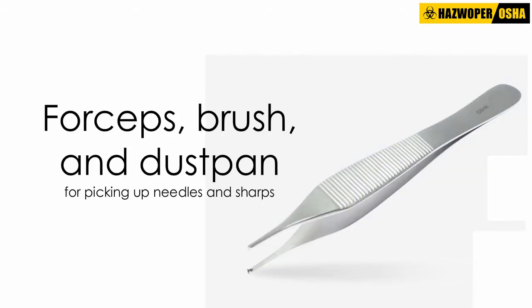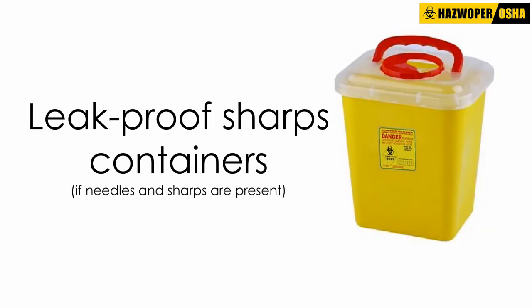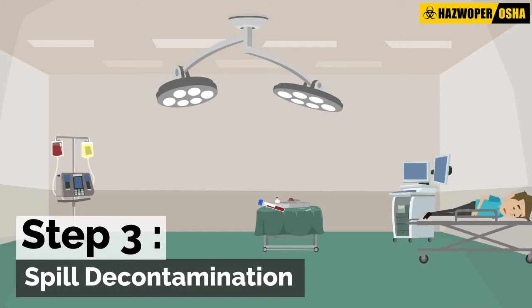The spill kit should also include forceps, brush, and dustpan for picking up needles and sharps; leak-proof sharps containers if needles and sharps are present; and biohazard bags.